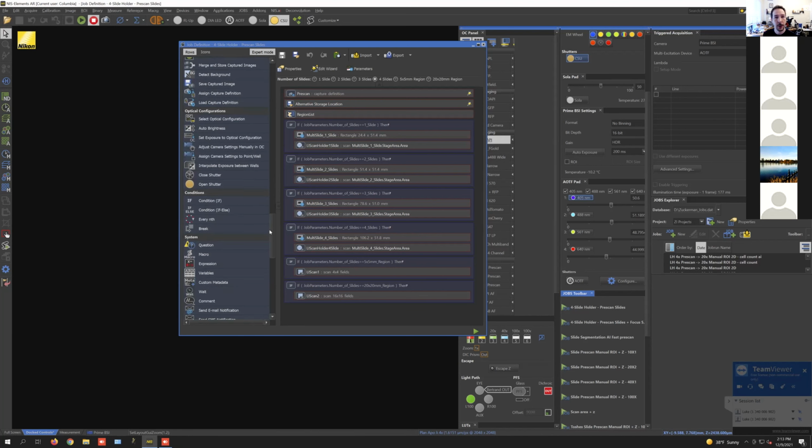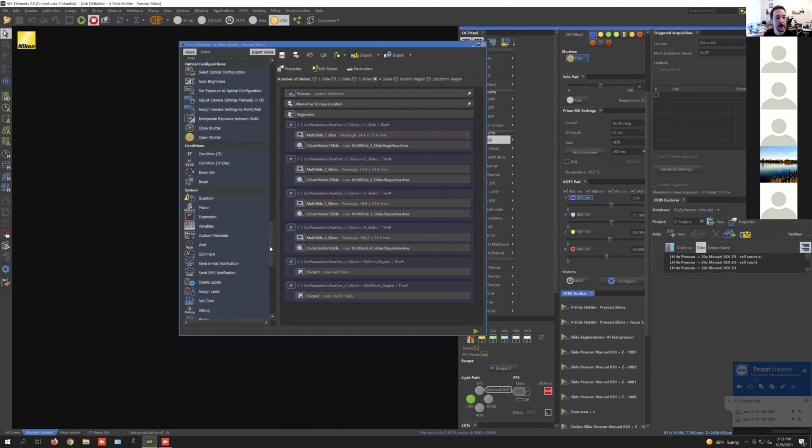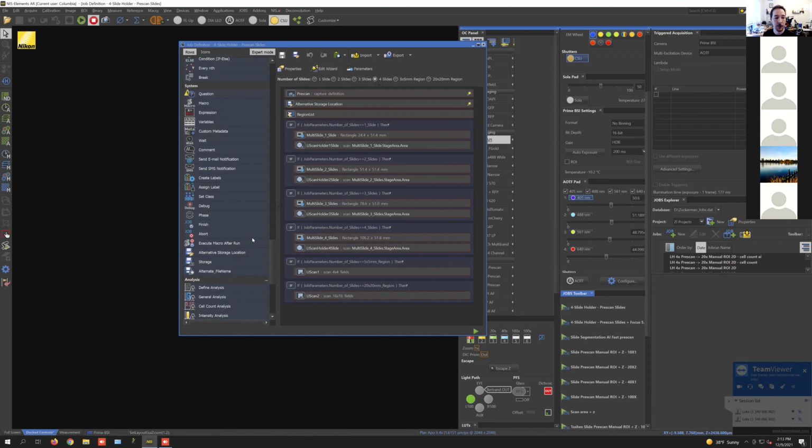And then because it's a scripting tool, we can do things like if or, loops and all this kind of stuff. So like I mentioned previously, any kind of complex experiment where there are several passes, like detecting tissue, then detecting a cell, and then changing objective, all of those things can be thought about in here. And you can even get it to email you once it's finished if you want to go that far. So there's a lot of functionality in here.